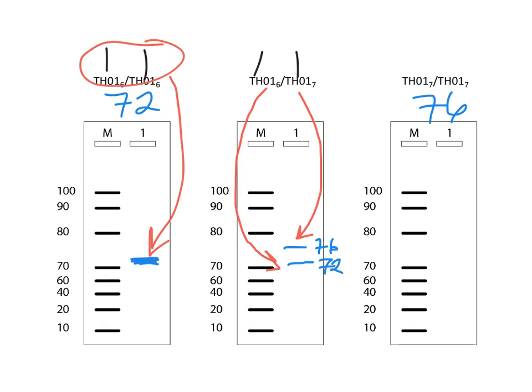Unfortunately, when we do PCR in real life, this sort of difference isn't as obvious, and I'll show you an example of a gel. You can see it if you want to skip ahead to the next slide. The band intensities aren't always as obvious, but indeed, the premise is true that if you have twice as much template, then you should produce twice as much PCR product.